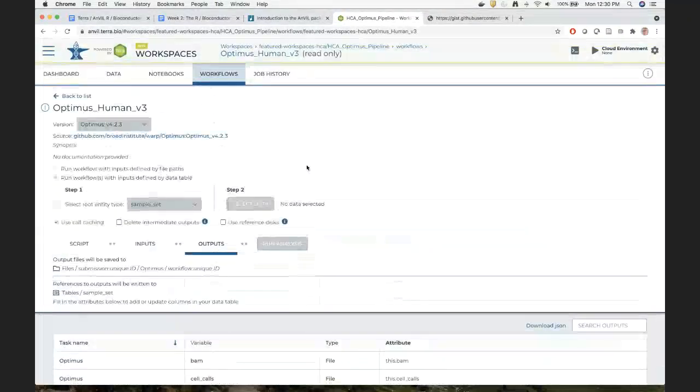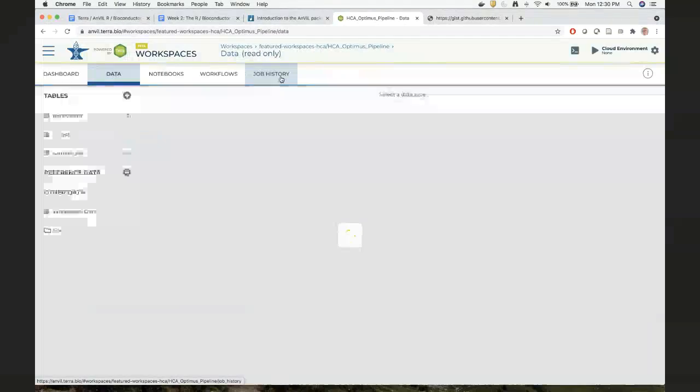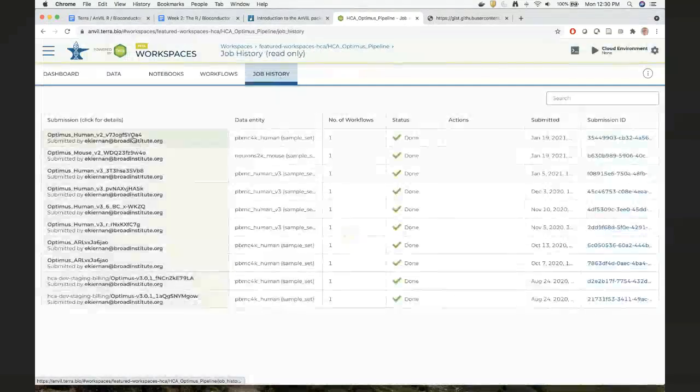This would be a computationally expensive thing, but the person who created this notebook has already run the analysis. I should say, here you can see what happens when you run the analysis. You get a job that records who's running the analysis, and its eventual fate, but it goes through stages like queued and submitted and running and broken.